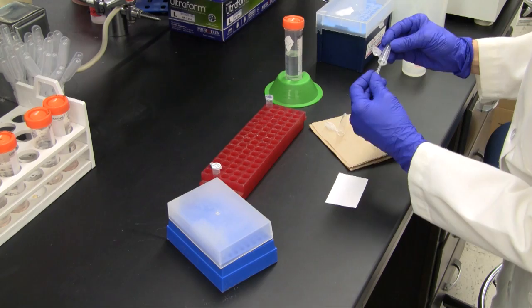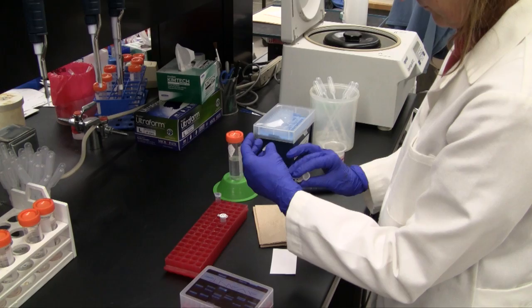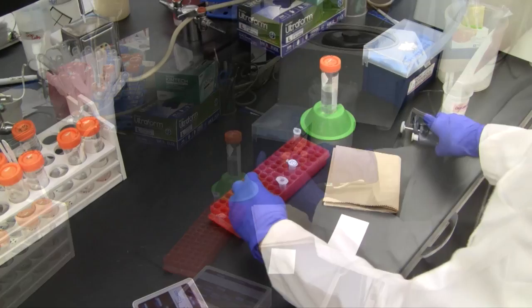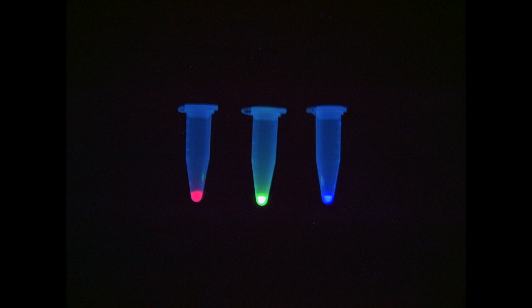The pellets are resuspended in 2X SSC, 1X TE, in a volume related to the amount of DNA in the nick translation reaction. For probes purified with column purification, this volume is distributed amongst the tubes. Resuspension is easier if tubes containing more probe receive a greater percentage of the volume. After the probe DNA is dissolved, the volumes are combined into one tube, which by convention is said to have a concentration of 200 nanograms per microliter. Probes are stored at negative 20 degrees Celsius until they can be used.